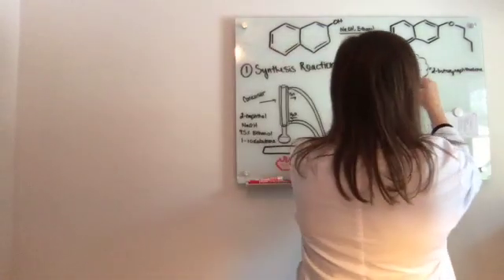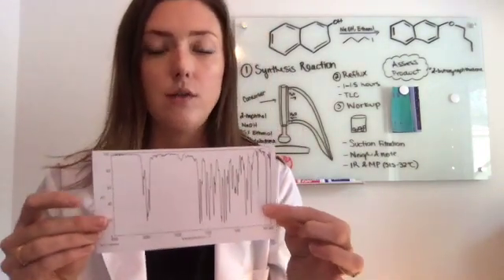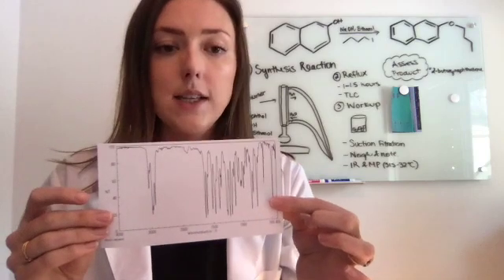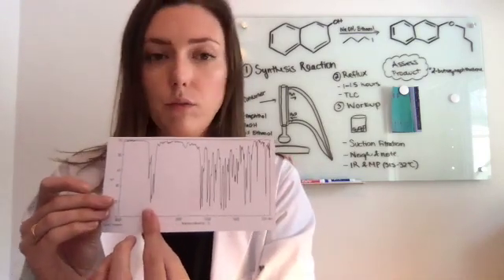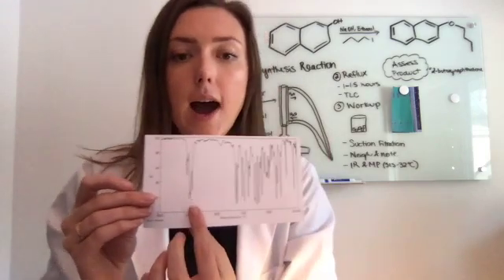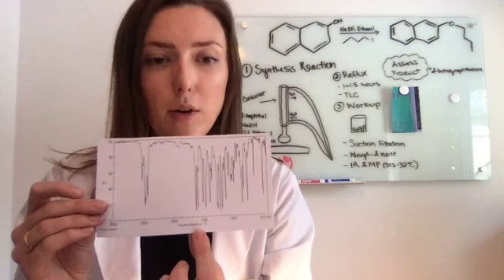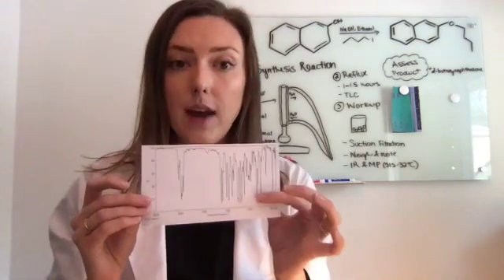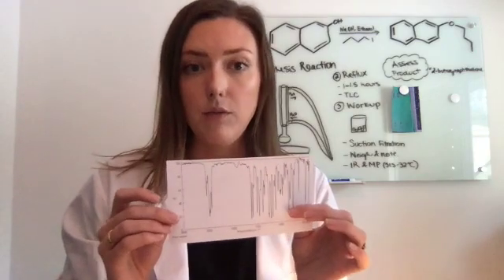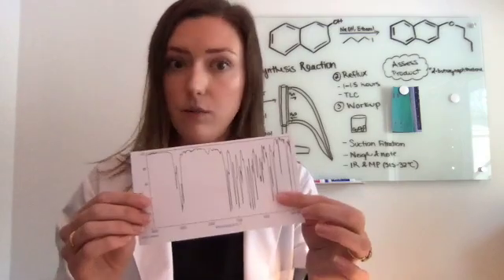The other thing that you can look at is if we're looking at the IR spectroscopy, this is what it should look like for a pure solution of 2-butoxynaphthalene. We can see here that we've got our hydrocarbons over at this peak, which is consistent with what we'd be looking for. And then we've got our aromatic rings here, just about at around maybe 1600 wavelength. And you can compare that to what the IR would be for our starting materials, again, to look at the purity. So this confirms the identity.